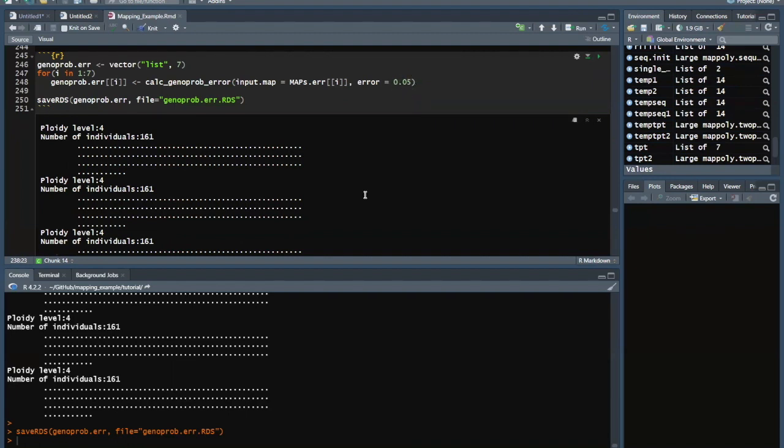We'll see a little graphic later on of what happens when we give it a global error. When we give it a global error, we let the chain be more flexible to visit other states and visit other possible phases to get hopefully a better map.